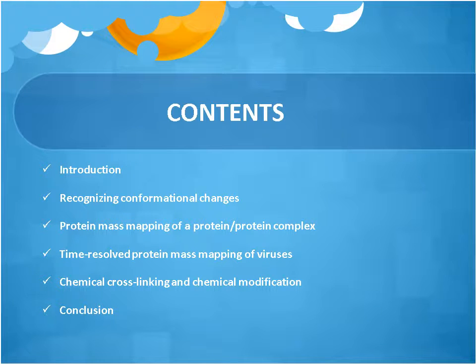Today we are going to have a look at the introduction, recognizing conformational changes between different protein states, protein mass mapping of a protein or protein complex, time-resolved protein mass mapping of virus, followed by chemical cross-linking and chemical modification, and finally the conclusion.